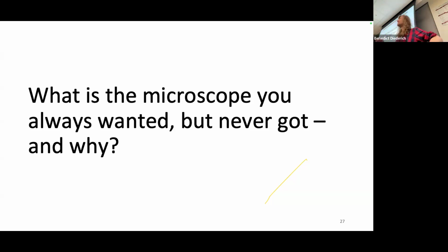I don't know if it could be done with the cubes, but an electron microscope. Okay, electron microscope. That's indeed the edge of optics to me, at least. But I've heard of people eventually doing that cheaply. It's tough, I guess. You need to have at least vacuum-proof cubes.